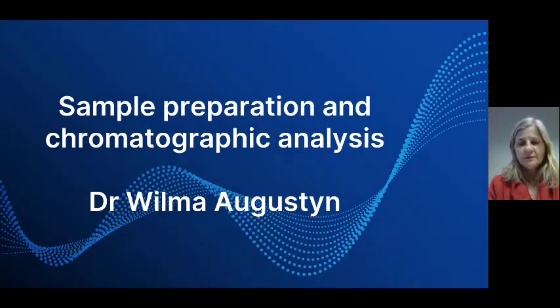I'm focusing on plant extractions and separation and identification of compounds, but this is applicable to any separation that you're going to perform. As I said, I'm presenting the sample preparation and chromatographic analysis.